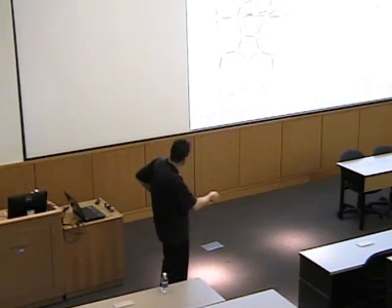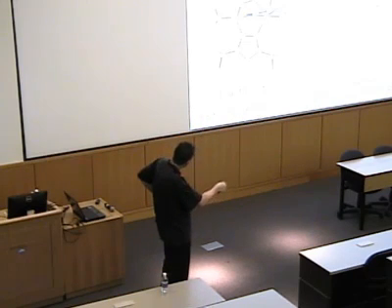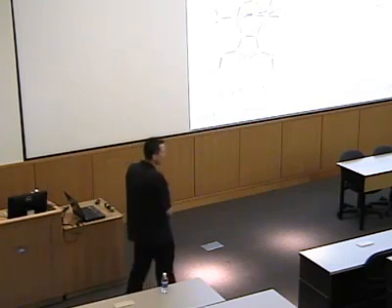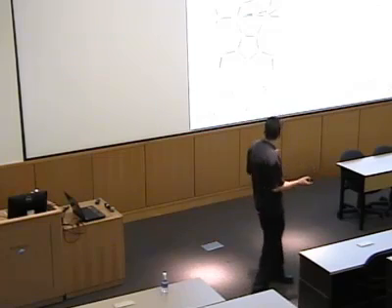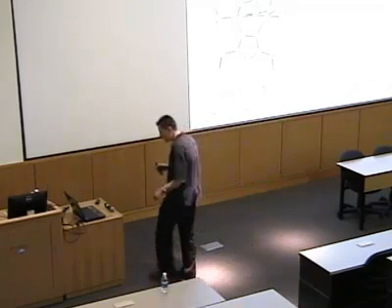And here's your MCD spectrum, where now your d-d transitions are actually the most intense here, especially this one here, number 3. And then here, this is the charge transfer region. You can see there are some decent transitions here. And as we go up, intensity dies off. So your selection rule is kind of opposite to what you see in an absorption spectrum. So that's already a pretty useful property. So in this sense, MCD is complementary in that way to absorption spectroscopy.